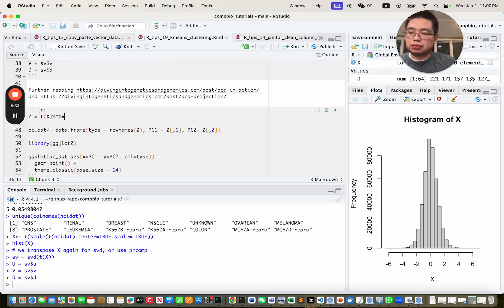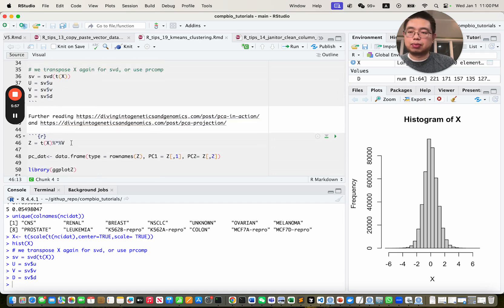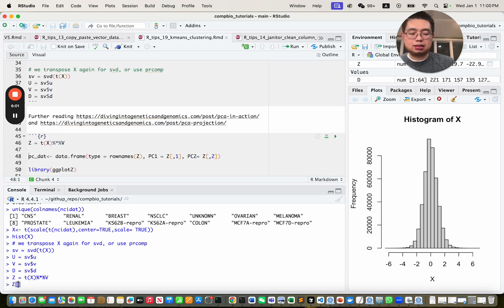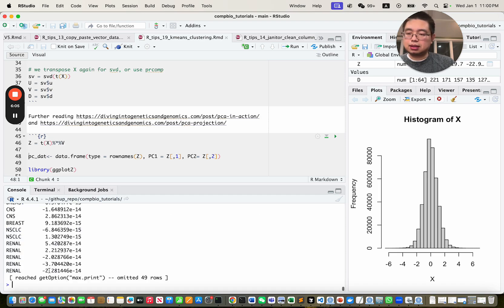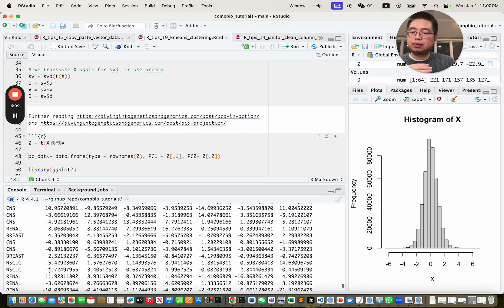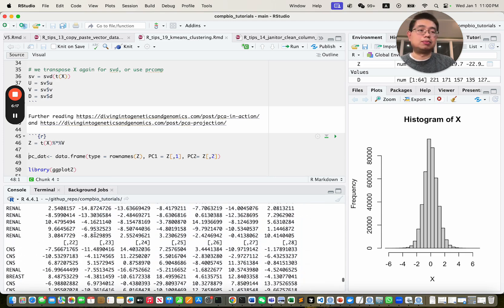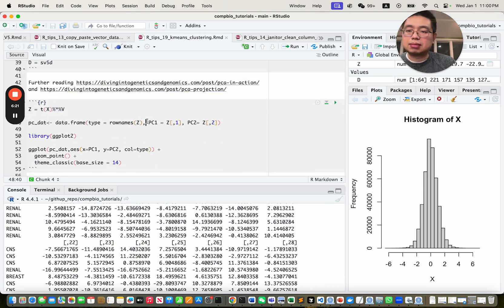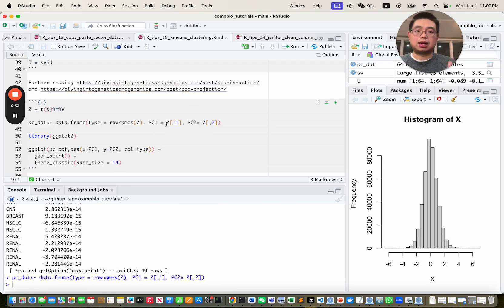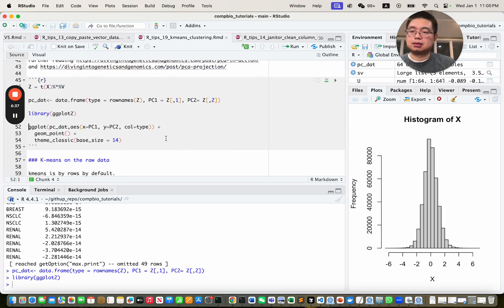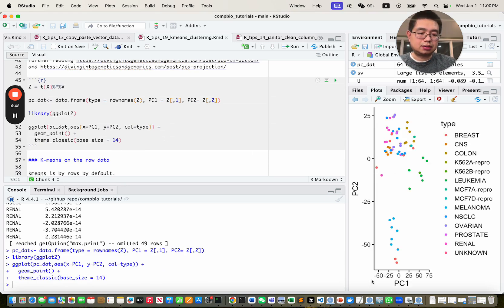Each row in Z is one sample and each column is one PC. You can use just the first two columns, PC1 and PC2, to make a PCA plot. Let's make a data frame with the row names of Z (the cancer types) and PC1 and PC2. Now we use ggplot2 to plot the PCA plot. You can see PC1 and PC2, colored by cancer type — similar cancer types roughly group together in the PCA space.